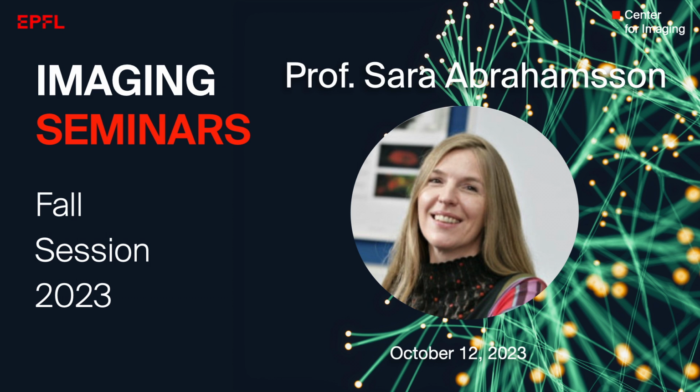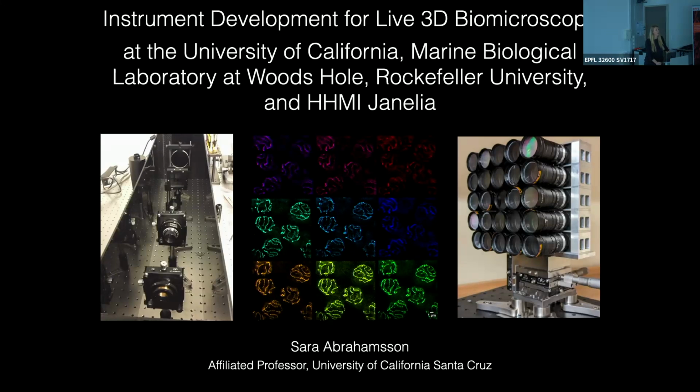I really want to stress through this talk that we should think about diffractive optics much more than we do. We know that there is a problem with it, which is chromatic dispersion, but you can solve that problem. And once you solve that problem, you have complete freedom. Because when you are in Fourier space using a phase grating, completely transmittive, you can multiplex beams, but you can also control their wavefront any way you want, almost. So the sky is the limit and your fantasy is the limit to what you can do in Fourier space.